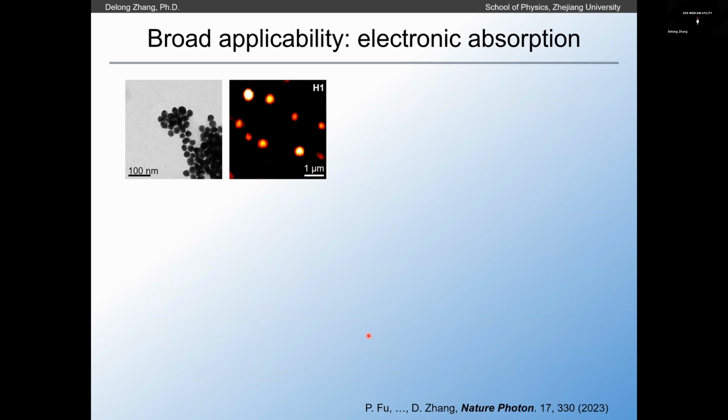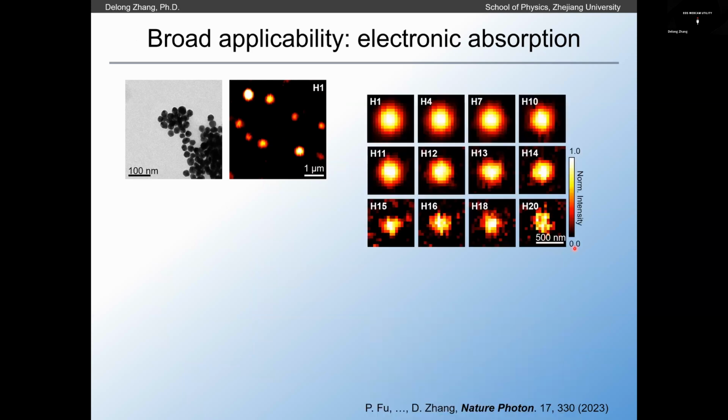And beyond that, we went back to conventional photothermal imaging, where we use gold nanoparticles to test the spatial resolution. When we tune to the higher harmonics with, of course, visible pump pulses, we do see an increase in spatial resolution.